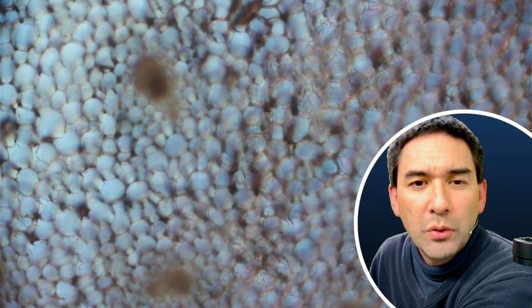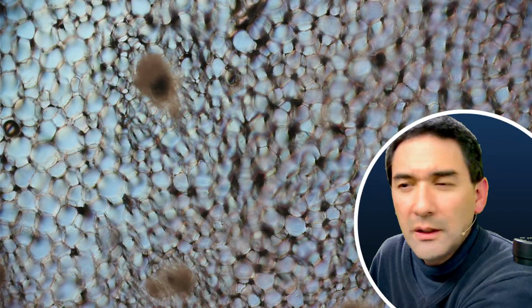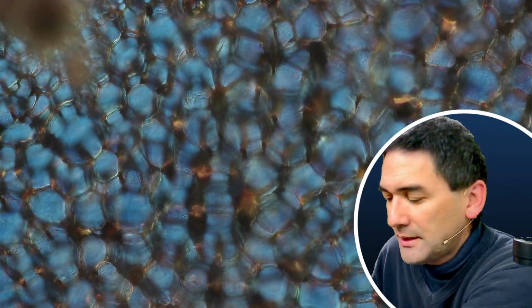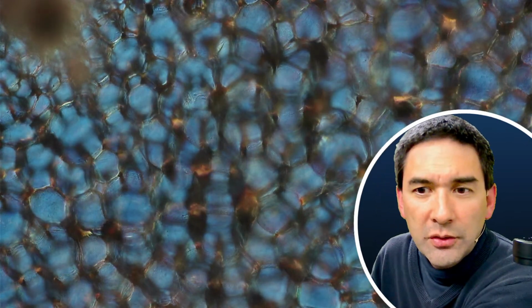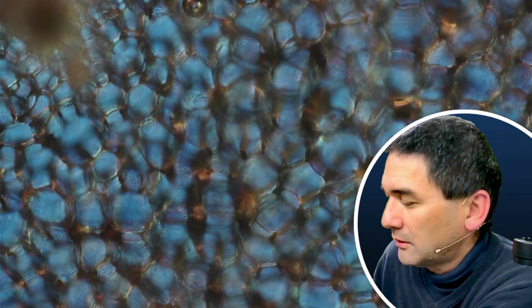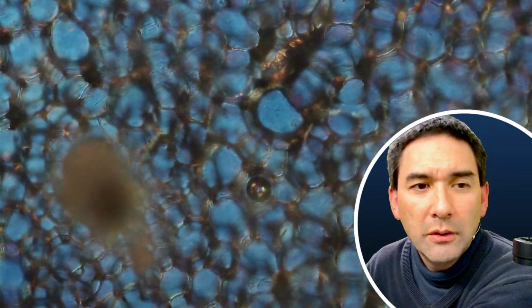By focusing, you can actually see how many cell layers thick it is. Here again, maybe I have to close down a little bit. Now for those of you interested, I've basically connected the camera over HDMI. My camera out has an HDMI connector, and then I'm converting the HDMI signal to a USB signal. I've got this not so expensive converter, and that's basically how this cauliflower looks.